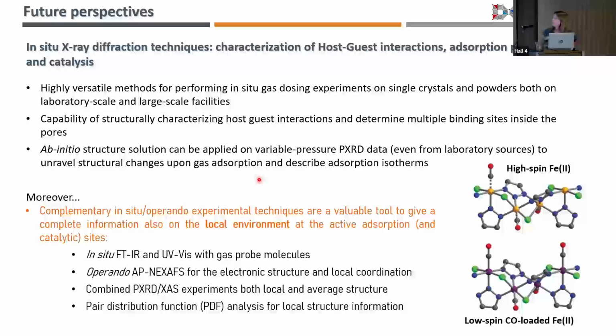Moreover, moving to more complex experiments, complementary in situ or operando experimental techniques are valuable tools to give complete information, not only on the average structure of the MOF, but also on the local environment, when information on the local structure is needed to describe the system.